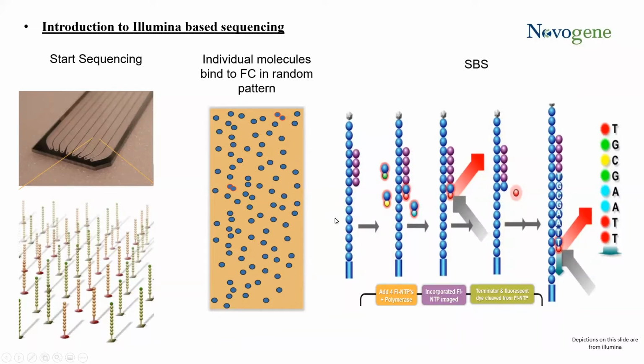So the way Illumina-based sequencing works is sequencing by synthesis. So we have our oligos added here. We have incorporation of fluorescently labeled NTPs, right? So once we have that incorporation, a blocker or a terminator will be added such that another nucleotide cannot be added. So we can then only get one call at a time. If this wasn't in place, then this machine wouldn't be able to tell at what position or at what cycle this base is being determined. So it's important to know these distinctions here.